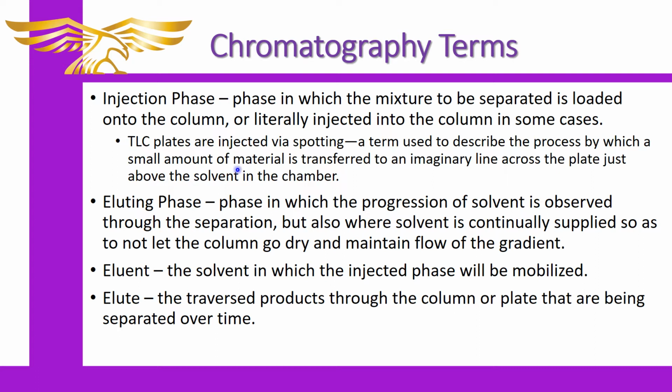As far as the eluting phase that we mentioned, that phase is the progression of the solvent through the media that's going to aid the separation. That can normally be achieved by the pumps on those bigger systems, but in this case it's the solvent moving up the plate. And so that is the eluting phase for a TLC plate. And of course, to maintain elution, you have to have the right setup, and that's even critical in a TLC experiment. So you do have to do things that promote elution.